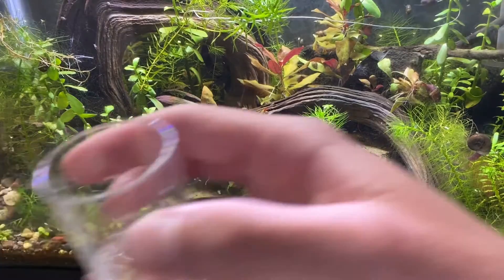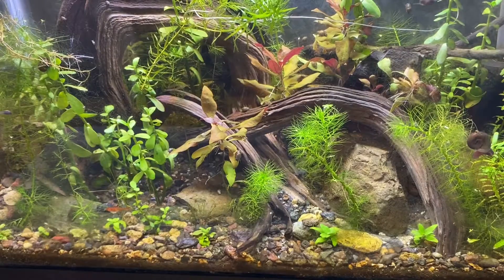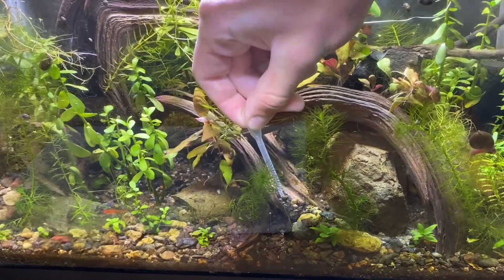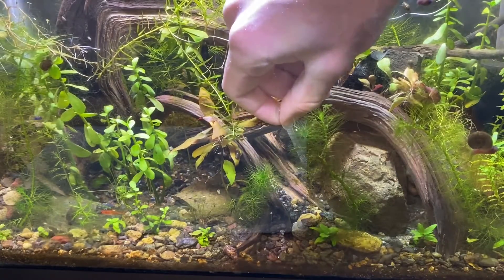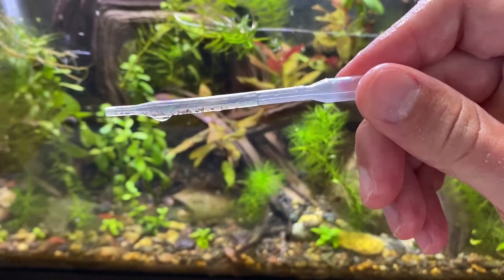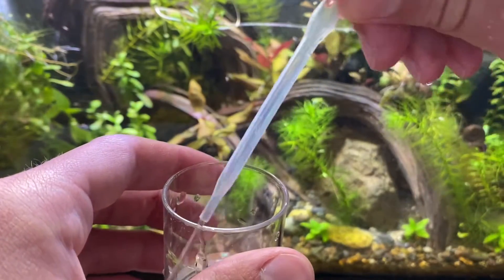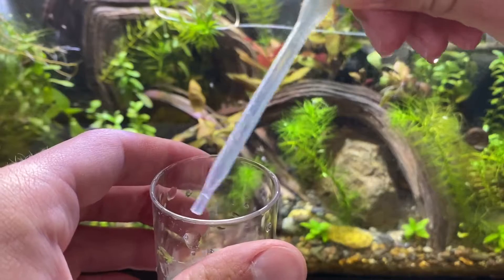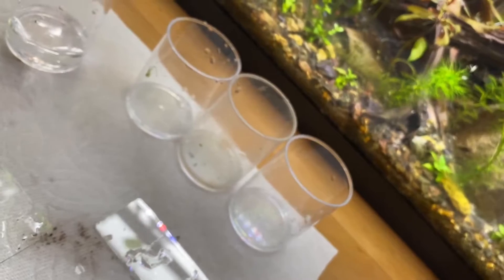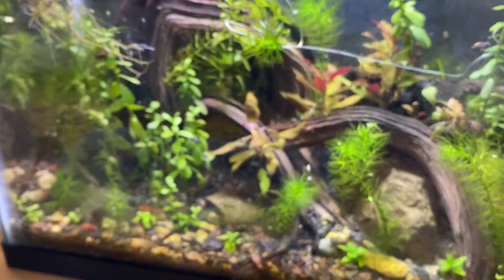So I'm going to go in with the pipette and stick it in and suck up some fish poop and mulm, that sort of thing. Then put it in the little cups and put it on the slides and see what we can see. I just got a little cup of the aquarium water and I'm going to take this pipette and go into the gravel and hopefully suck up a bunch of gross, nasty stuff. I just completely missed the cup and sprayed it all over this paper towel, so I'm going to have to redo that, but you guys get the general idea.